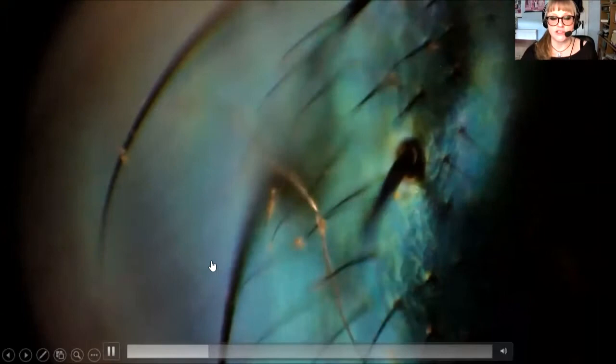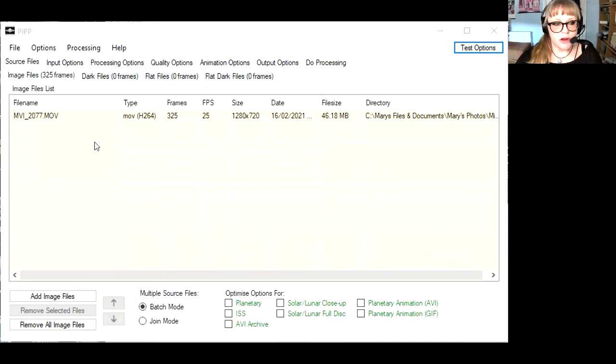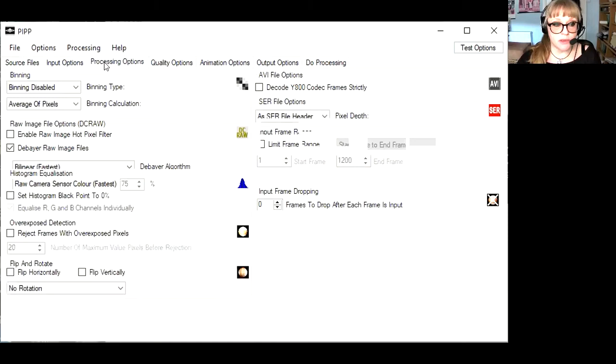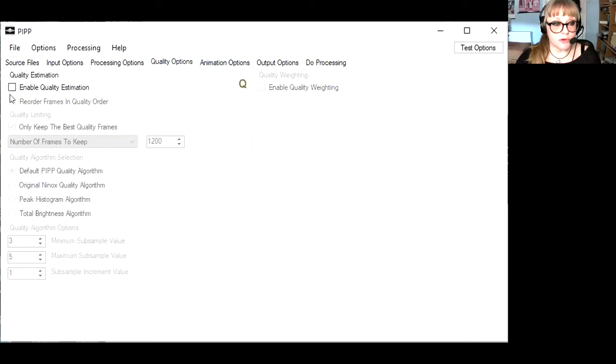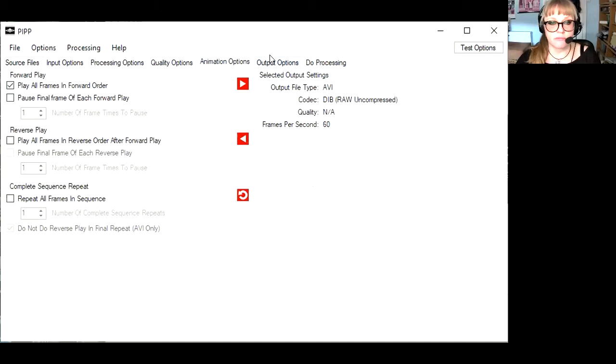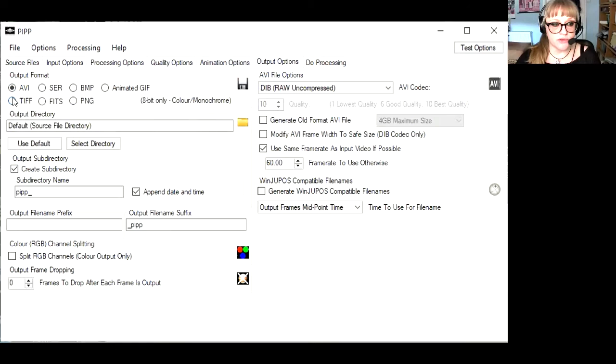Here we are in PIPP. I've just dragged and dropped the MOV file - that's just the video straight off the Canon 1100D - but you could also just shoot an AVI with a planetary imaging camera, anything like that. You just drop the video into PIPP and then it will automatically select batch mode. All of this stuff, basically just keep it raw and don't touch anything. The default is absolutely fine. Don't bother with quality estimation. I generally keep things in a forward order because it helps me to scroll through pictures later on. Over here, instead of an AVI, you want to select TIFF, and what that will then do is extract every single individual frame from that video.